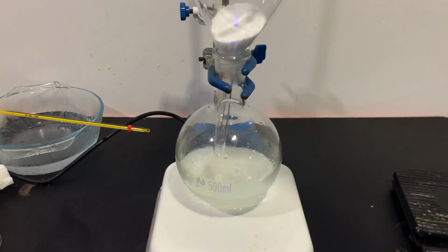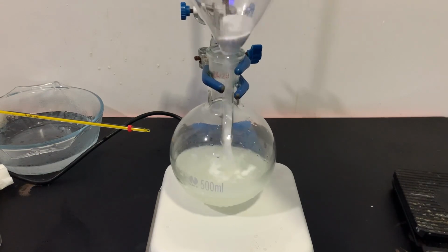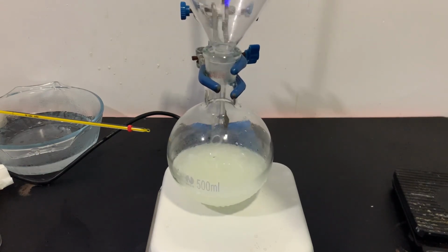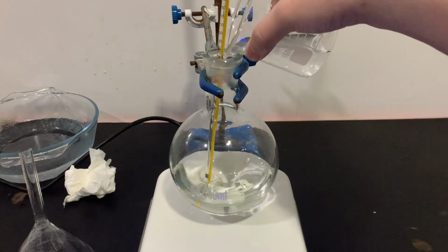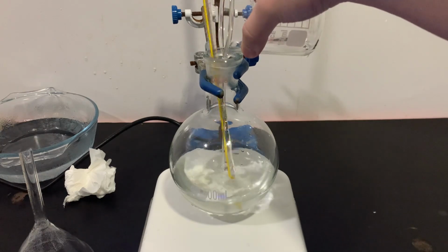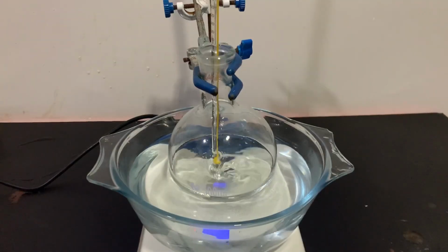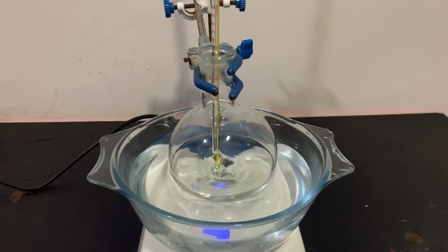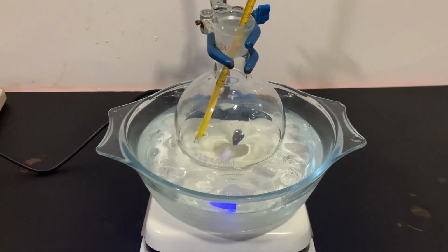After adding all of the bleach, I took the flask out of the ice bath and added in 13 grams of phthalimide. When all of the phthalimide dissolves, I added in a sodium hydroxide solution by dissolving 11 grams of it in 40 milliliters of water. The flask was then heated at 80 degrees Celsius on a hot water bath for 30 minutes. After the 30 minutes, I then cooled it again with an ice bath.